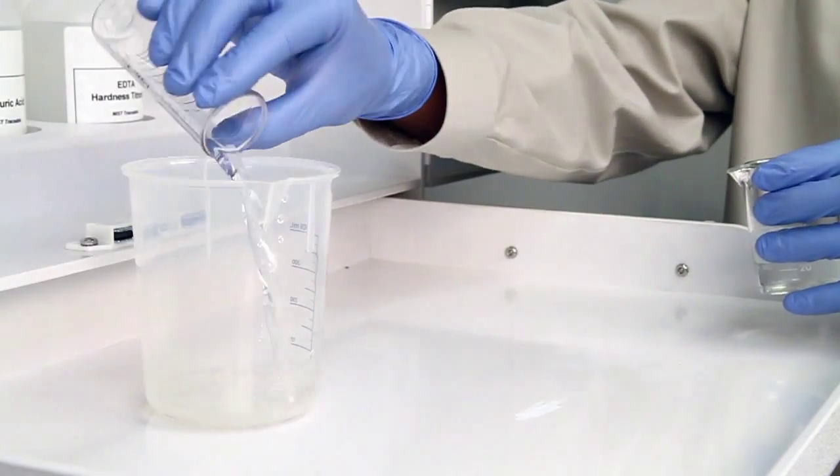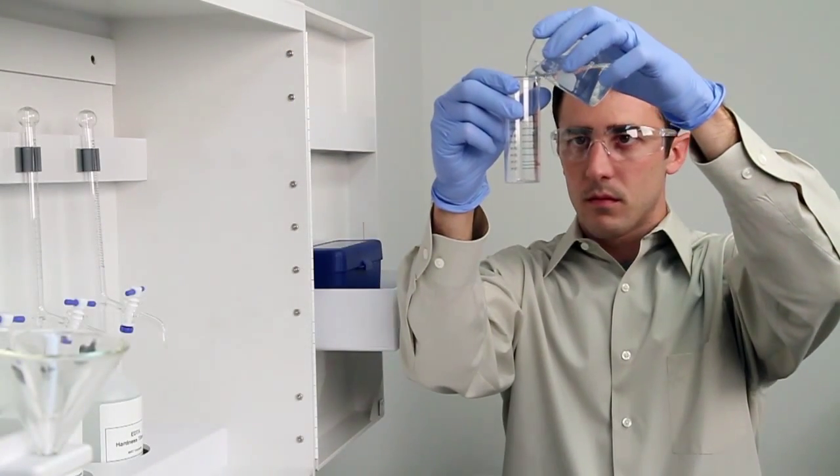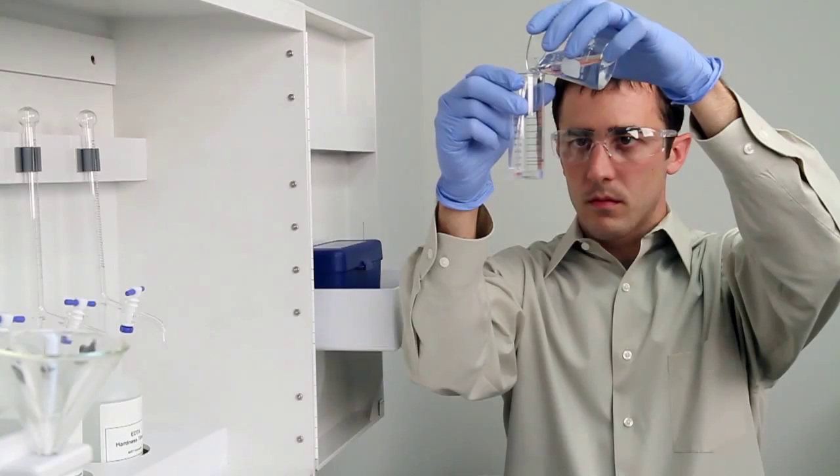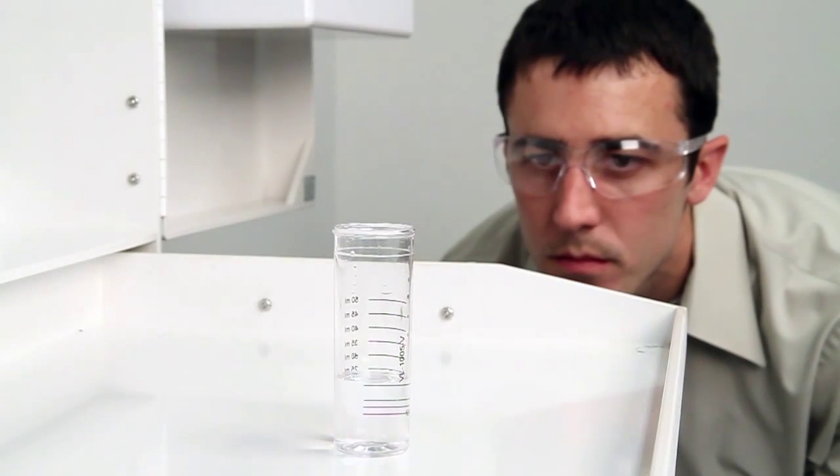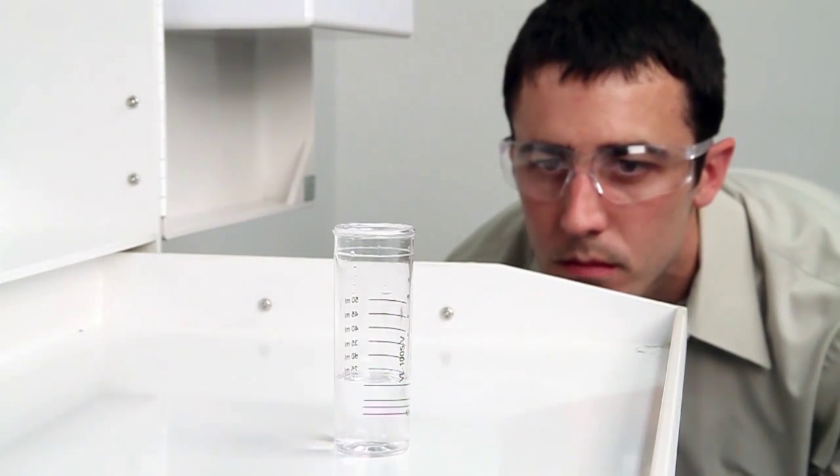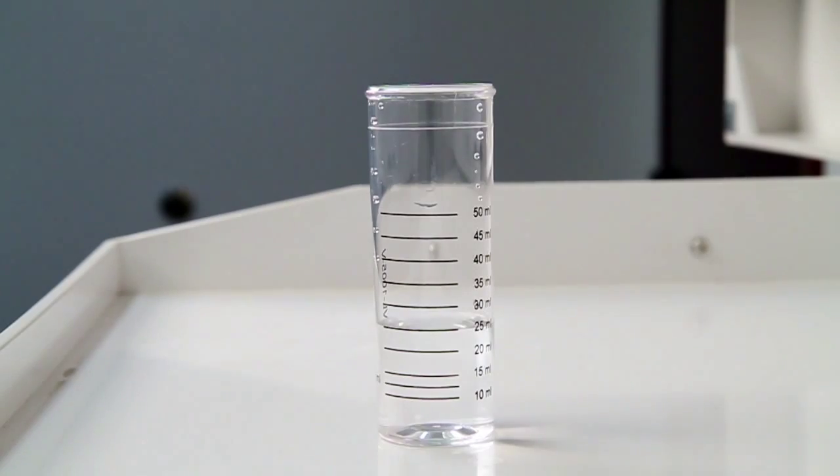Hold the vial close to eye level while pouring to ensure you have an accurate sample. Place the vial on a level surface and bend down to eye level to verify you have collected an accurate sample. The slightest change in sample size will lead to inaccurate results.